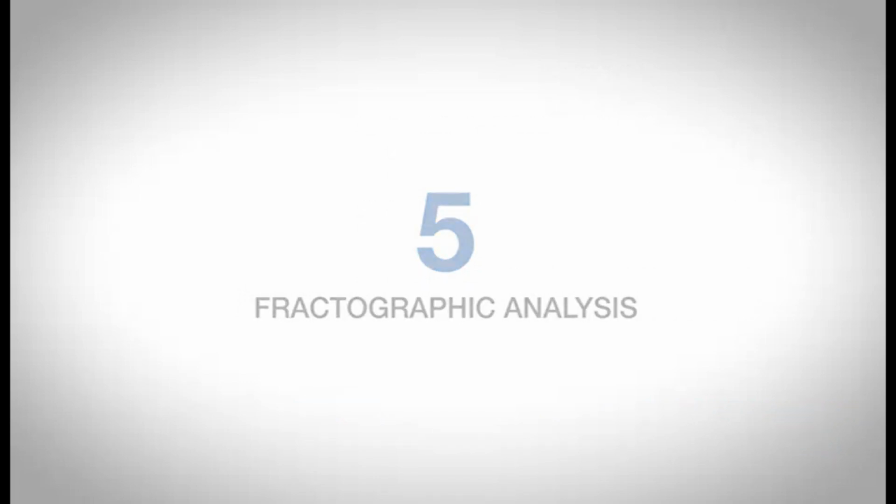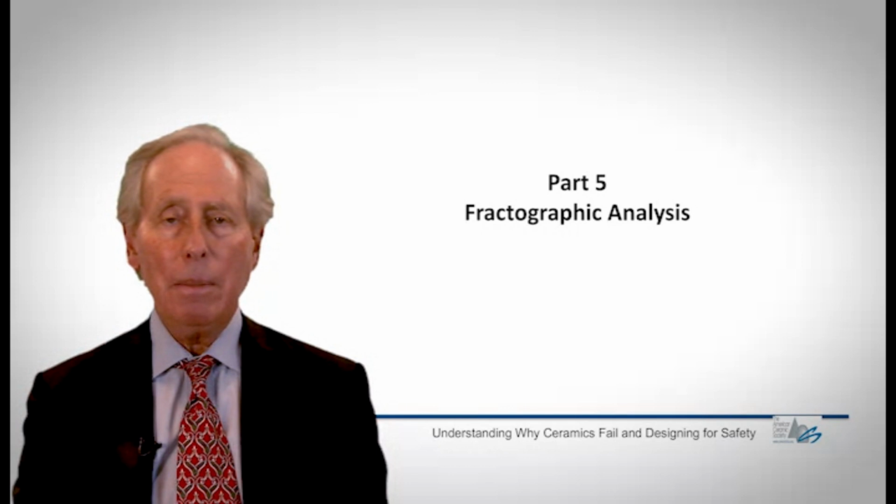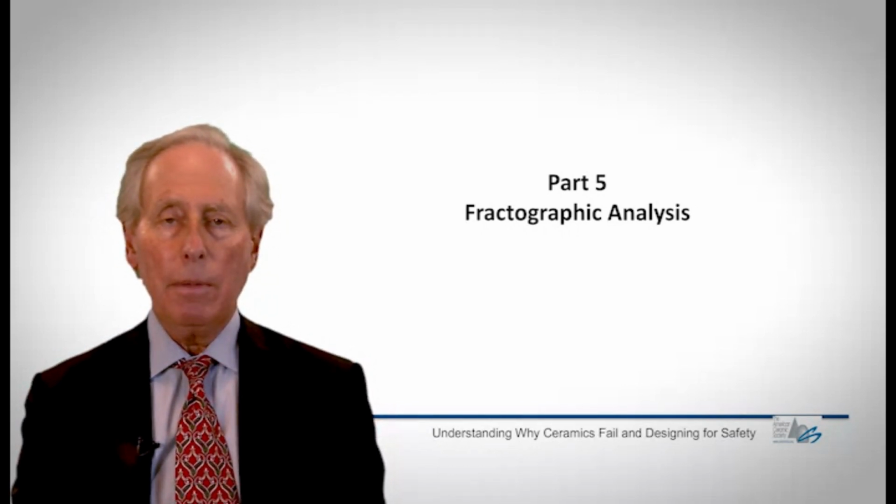So now I want to talk in some more detail about a topic that I've mentioned a number of times throughout these series of lectures, and that is fractographic analysis. And what I really mean by that is looking at a fracture surface, measuring some of the features on a fracture surface that give us a great deal of information on what caused the fracture.